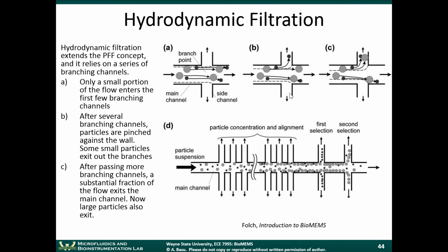So this pinch flow fractionation concept can also be extended into a more general technique called hydrodynamic filtration. Hydrodynamic filtration relies on a series of branching channels. And in these branching channels, the particles are constantly being pushed towards the outer wall. So it takes that pinch flow fractionation concept and it's just repeating it over and over again, in some sense. That's the main kind of concept. But this is more specifics. Okay, it relies on a series of branching channels.